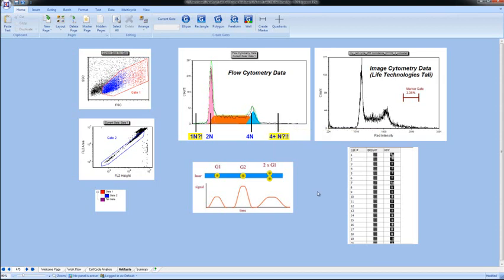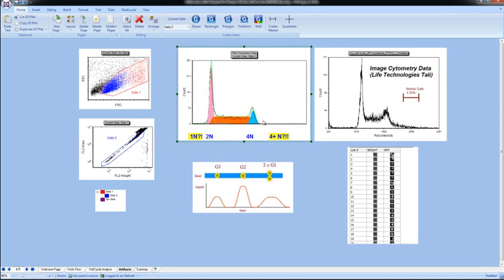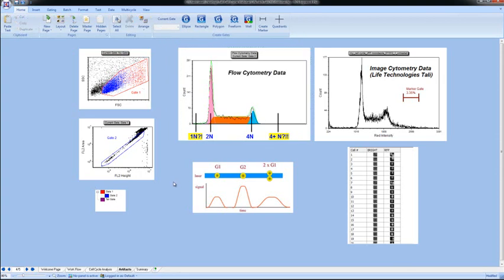So to remove those cells from analysis in flow cytometry, we create a gate on the area and the height of a cell, and if we apply that gate to this model, you notice that we're going to significantly clean up this model. We're now not accounting for these cells in our analysis, and our analysis is going to be done more accurately and correctly.